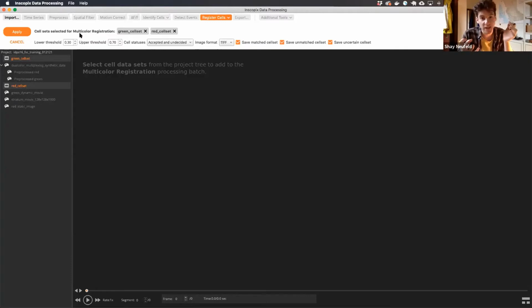The one thing we don't have in IDPS, which I've been hoping we can get resources for, but it's not totally high priority yet, is a static cell segmentation algorithm for automatic cell segmentation of static images. I think that would really be nice. It would benefit this as well as a couple other things, but hasn't quite made it onto the roadmap yet.